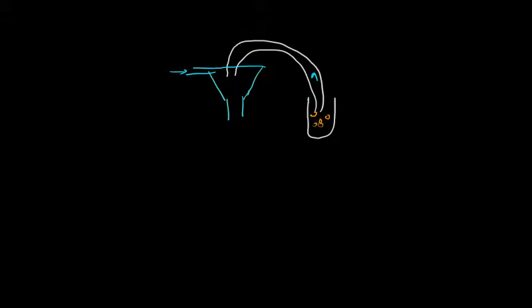The sheath and sample here are driven by hydrodynamic focusing, and we have the cells here, and there is a laser. The laser is illuminating the samples, and as the cells are crossing the laser, it's illuminating the cells and the signals are collected, be it forward scatter, side scatter, or fluorescence. This signal is displayed on the computer on our plots. We see these three populations. Anytime a cell of interest is crossing the laser, the cell shows up here as a dot. The other type of cell, when it is crossing the laser, shows up here, and so on and so forth. So we set the populations.